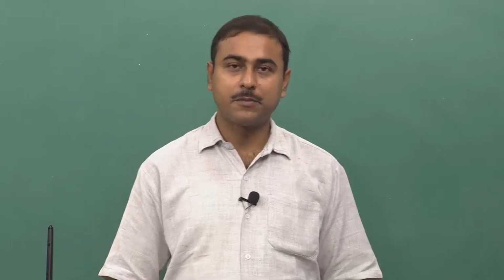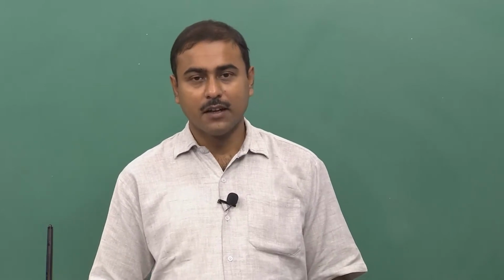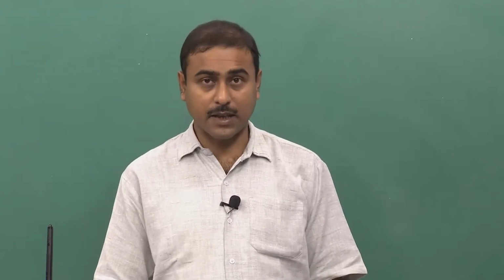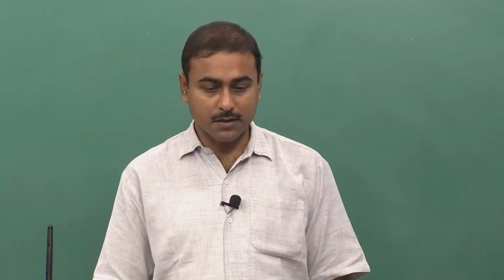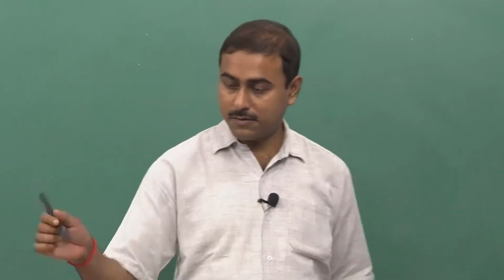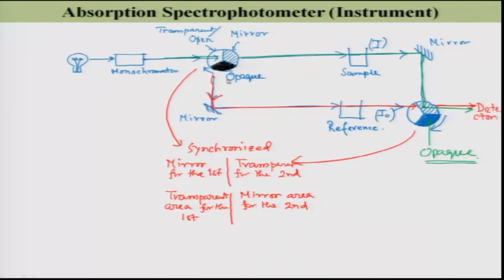So, welcome to the fifth lecture of the course Basics of Fluorescence Spectroscopy. Until lecture 4, we discussed several topics on absorption, and we ended with the double beam spectrophotometer.